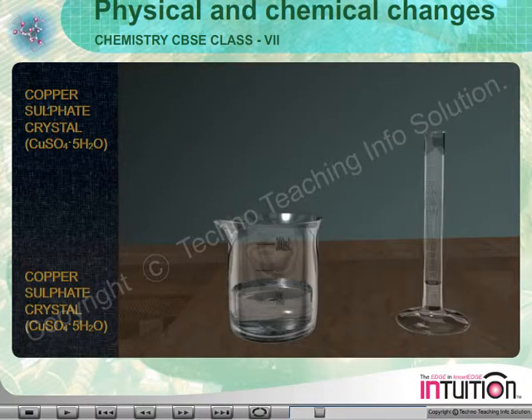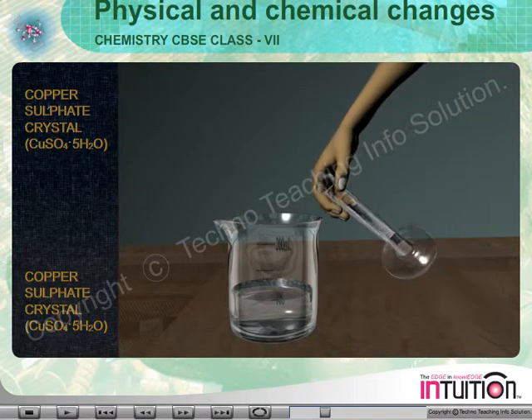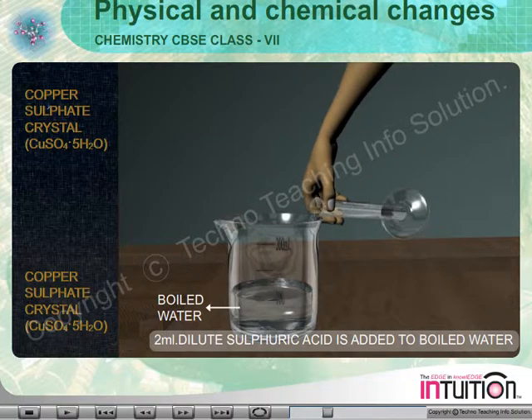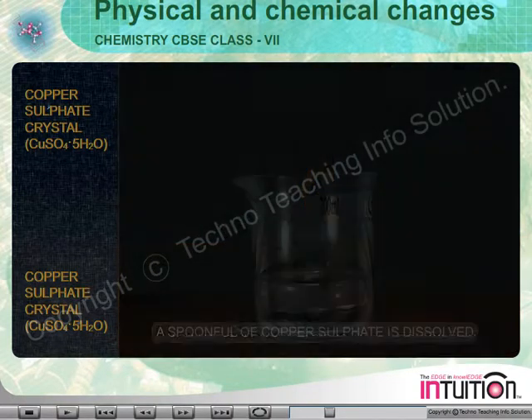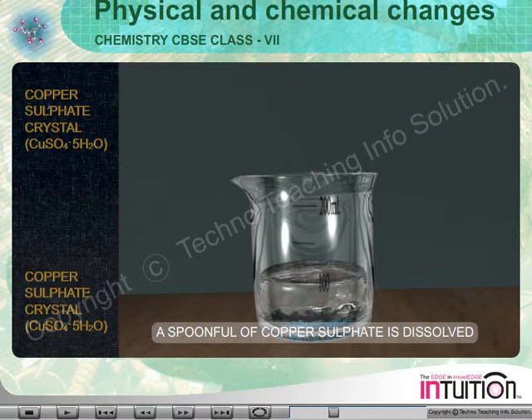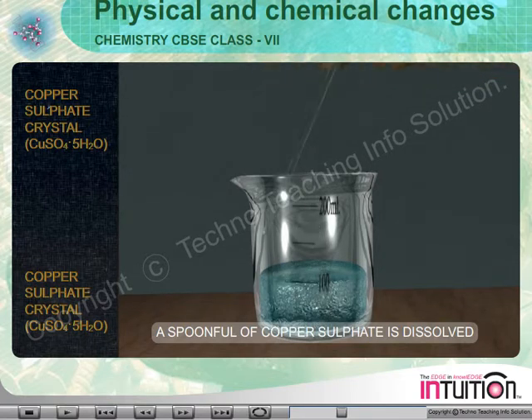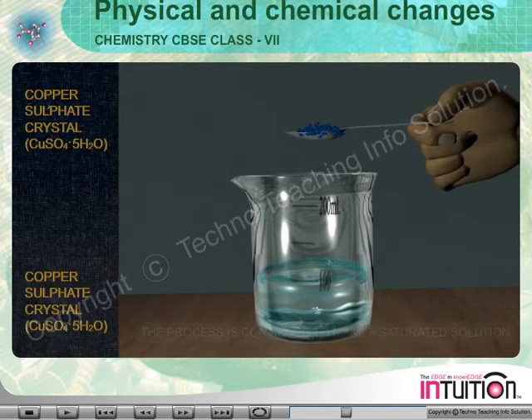After boiling, 2 milliliters of dilute sulphuric acid is added to the boiled water and a spoonful of Copper Sulphate is added and stirred. When all the Copper Sulphate dissolves, we add another portion.